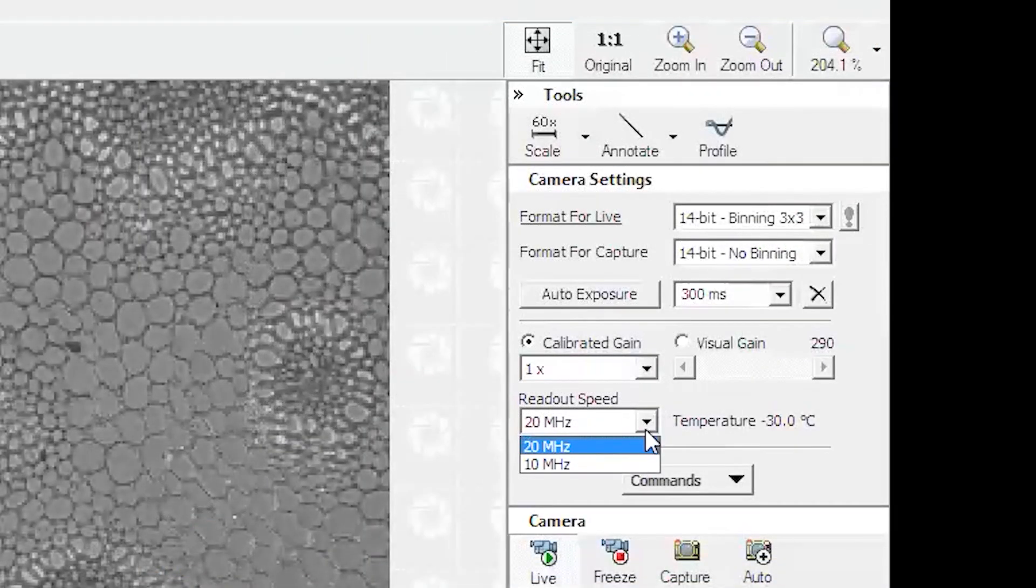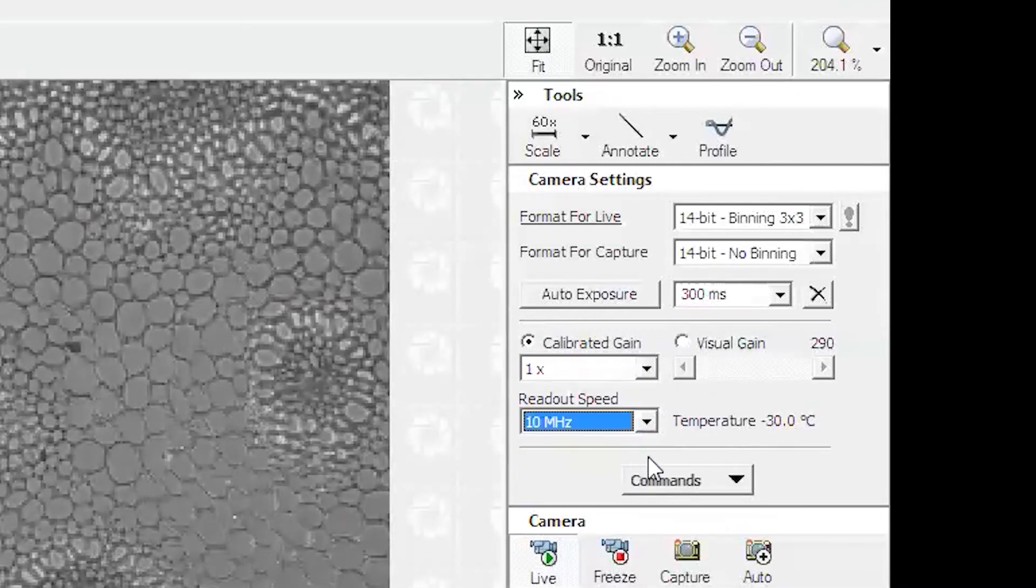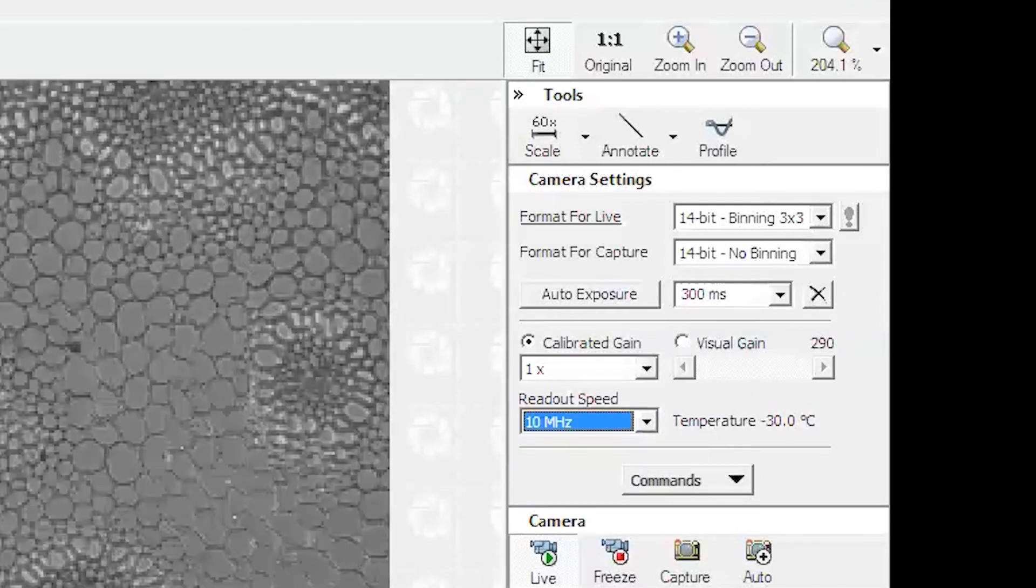The frame rate, if you go faster you will get more noise, so if you would like a high quality image, decrease the frame rate.